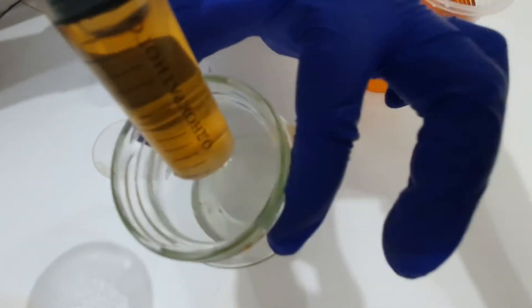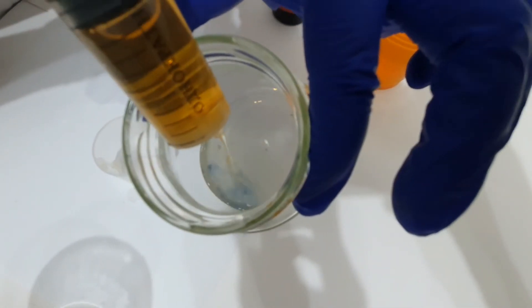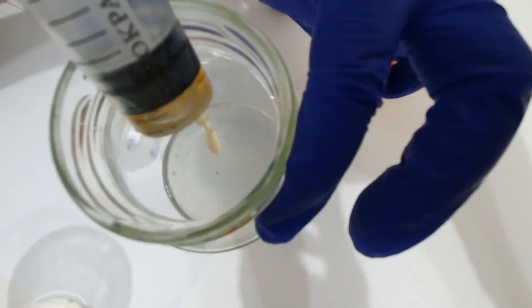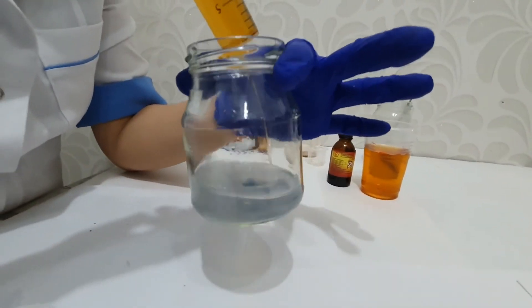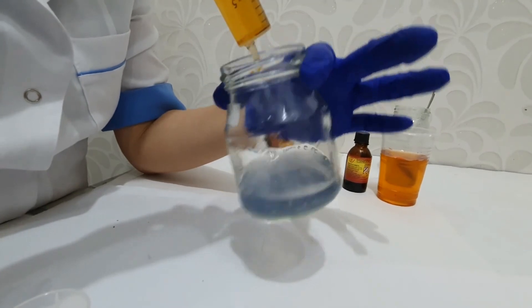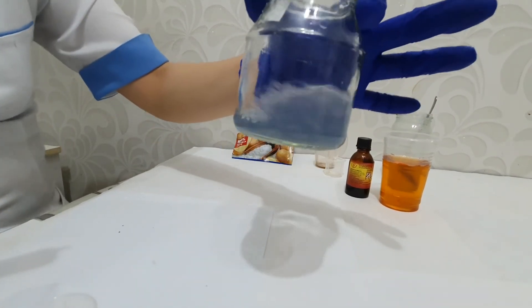We will stop the titration when a light blue color appears. 20 milliliters were used, so I'm going to refill the syringe. I refilled it and I'm going to continue the titration — now you can see that the solution turns light blue.